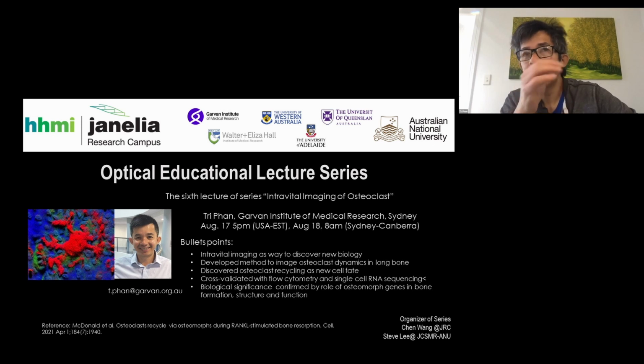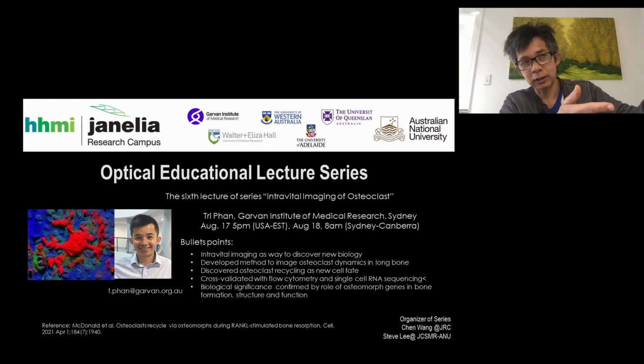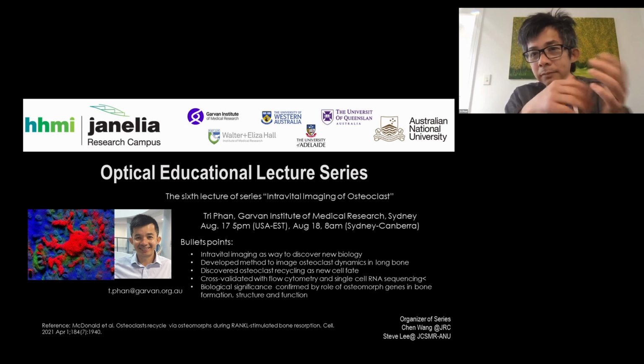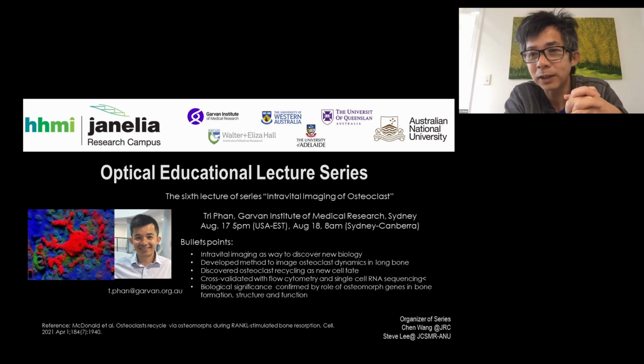And that dye, you're right, like all dyes, has a certain degree of toxicity. But we're hoping that the cells that make it in, get to the niche and engraft have overcome that. They've been selected as the ones that survived the toxic effects from the dye labeling.